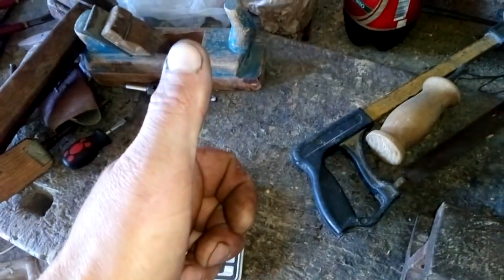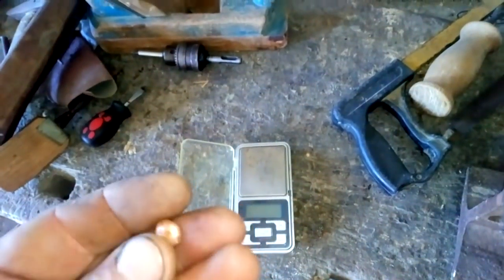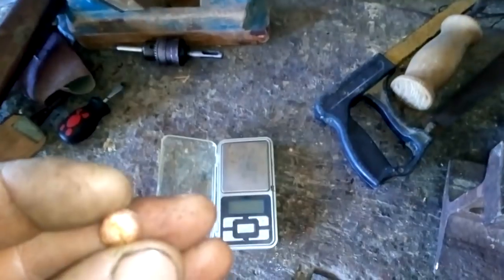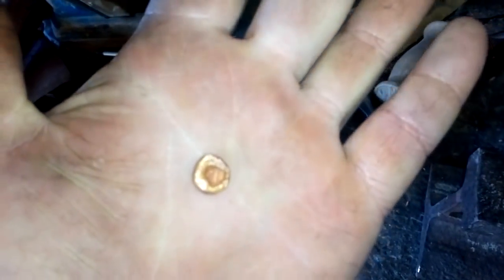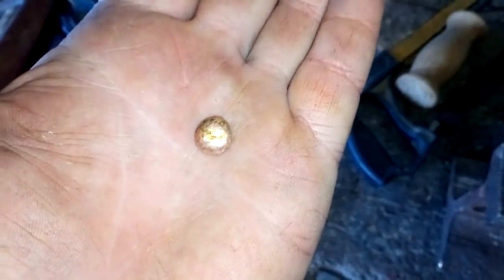Hey guys, what's up? Today we will try to really find some dirty gold. Here in my hand I got exactly a 3 gram very dirty gold. See that?